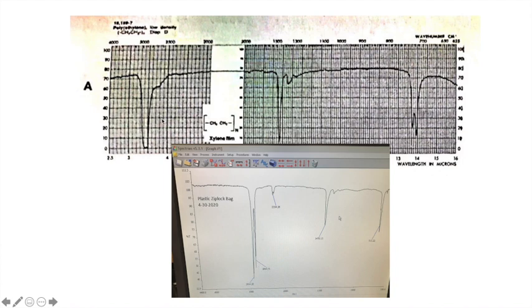And this is an older spectra too. But maybe that is the same as there. They don't have the CO2 in their signal, but that's all right, because they might have been purging nitrogen gas through. And then this looks pretty similar here. It's about 1,500, looks pretty good. And this little guy right here looks pretty good. I think it looks really good. This guy, theirs is a double little peak here, but ours isn't, but maybe it is a little bit.